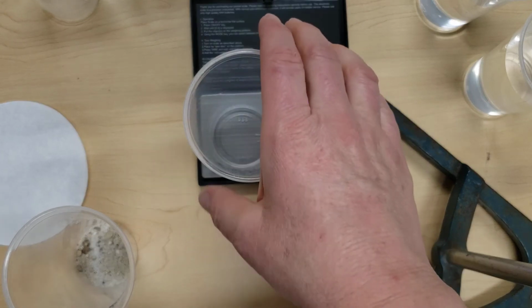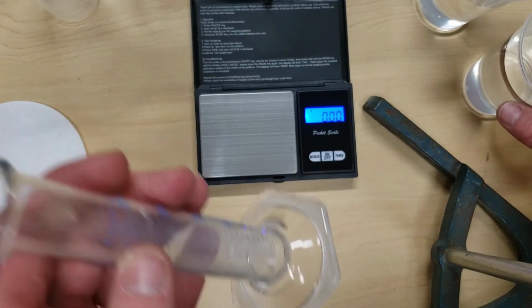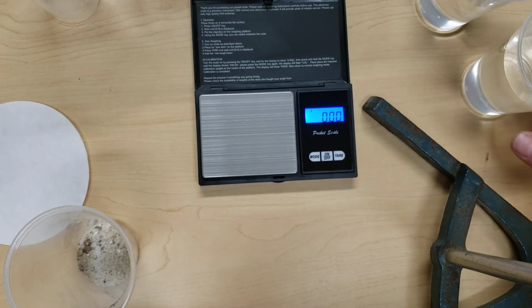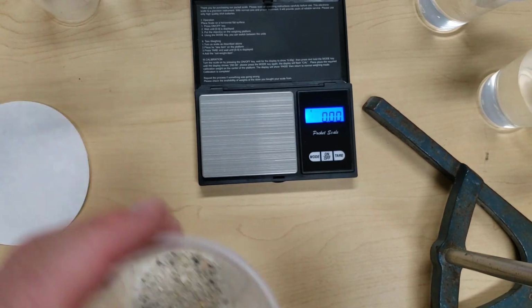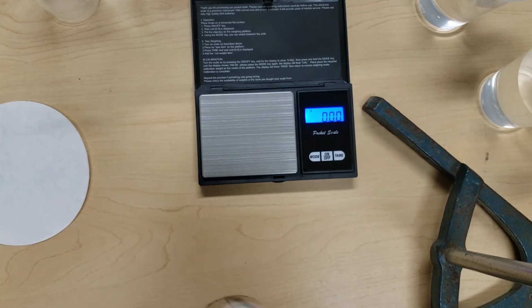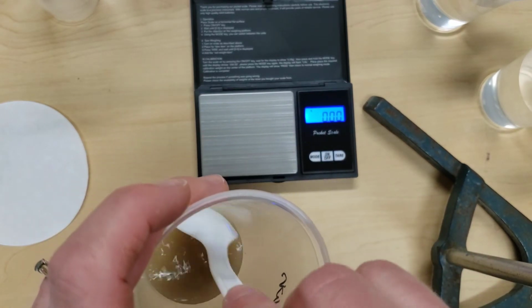And we're going to get 10 milliliters of water in our graduated cylinder. So we get 10 milliliters of water. We're adding it into our unknown and stirring it well. So our goal is to make this separation.